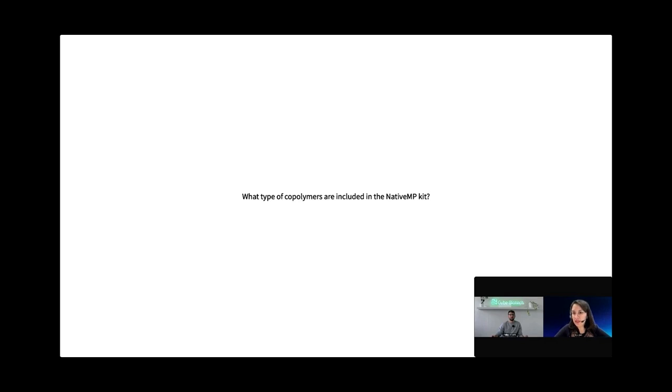So I'm going to start with a first question, and it's about the NativeMP platform, of course. Someone is interested, you mentioned already a few characteristics, but what type of copolymers are included in the NativeMP kit?